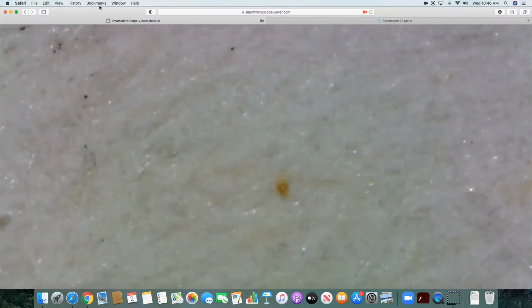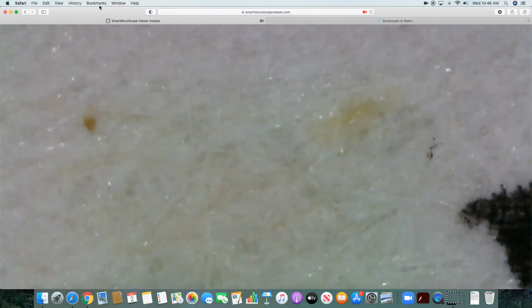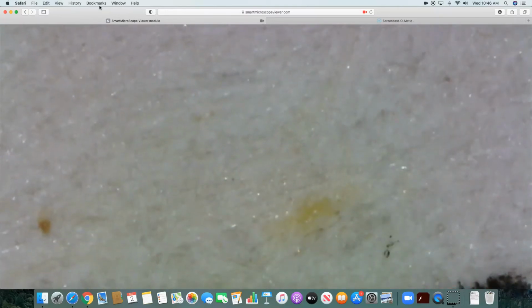So again, this book was printed in 1993, roughly almost 28 years old. All right, so now I'm going to switch books. But first, for question number 1, what are some things that you notice about this book, about the paper? What do you notice about the paper from the book printed in 1993?